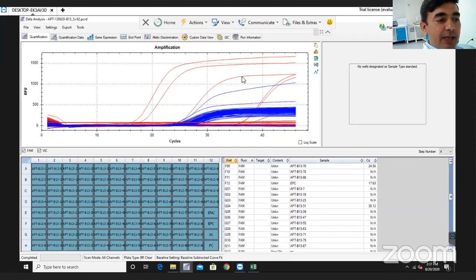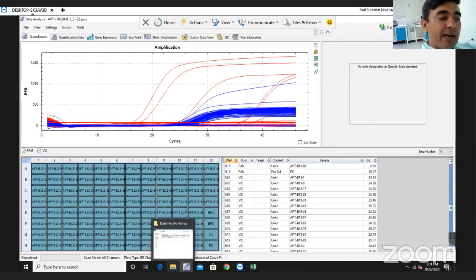If our peak is normalized, if our peak is straight, we give it due to the peak analysis. If the peak reaches a plateau position, from minimum to maximum, the peak levels are determined properly.